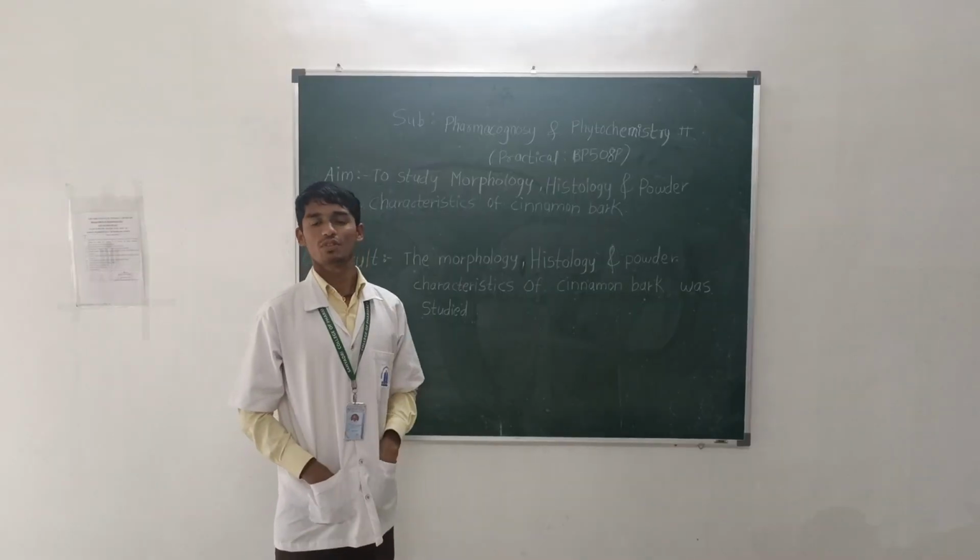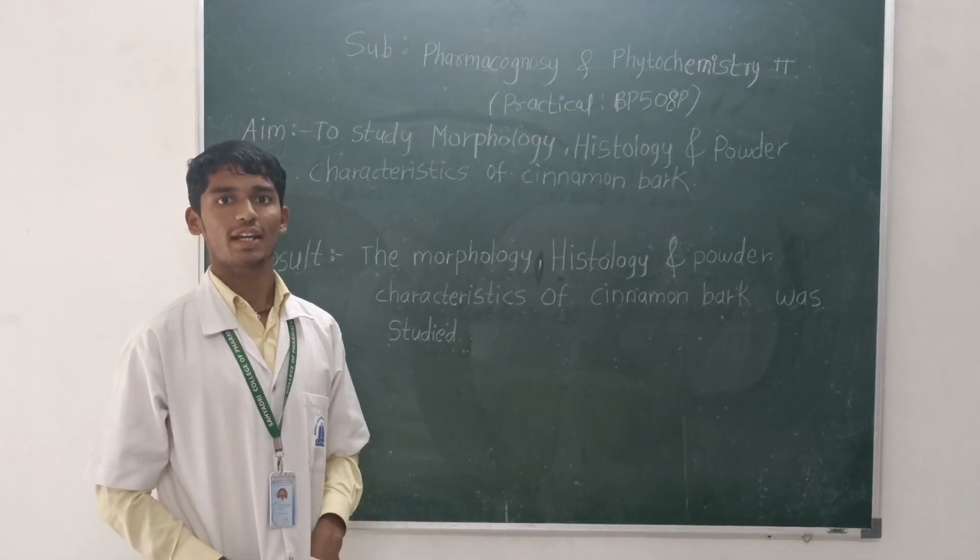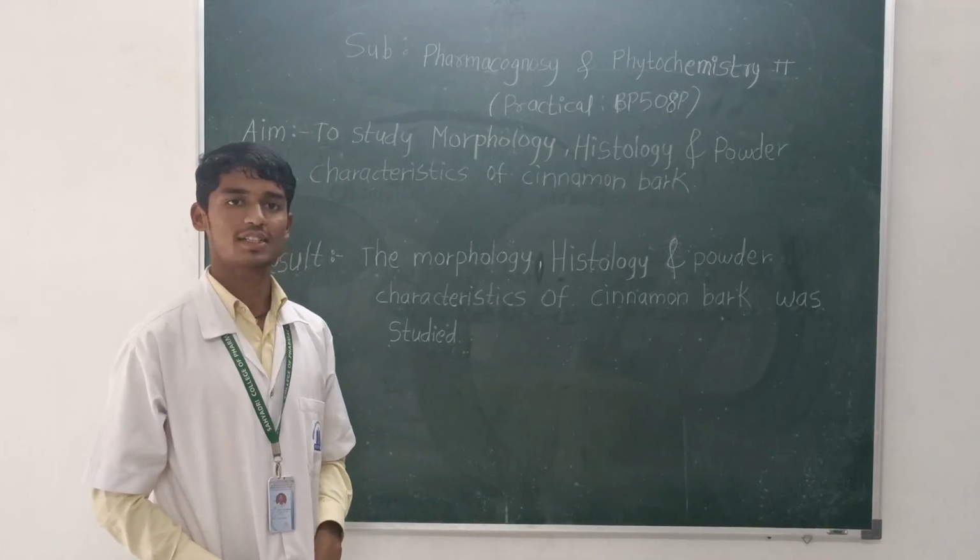The result of today's practical is that the morphology, histology and powder characteristics of cinnamon bark were studied. Thank you.